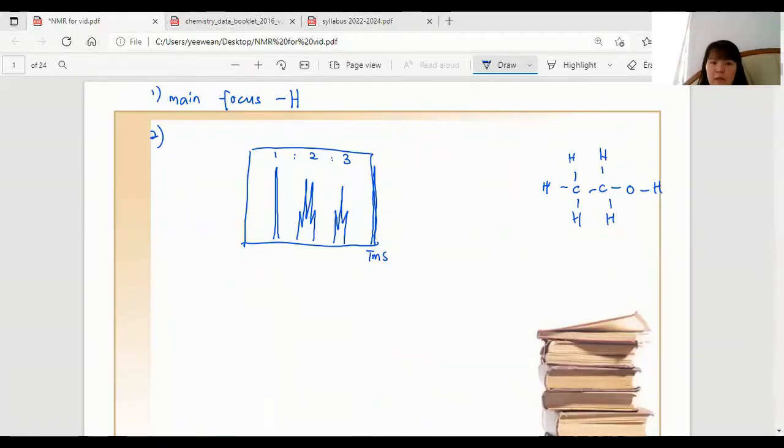This video is about Proton NMR Spectrum. So we're going to read Proton NMR Spectrum. Before this, you should already have some knowledge about organic chemistry. Okay, that said, Proton NMR. Our main focus here is the hydrogens that attach to something, for example, ethanol here. So you do need to have some organic chemistry knowledge to do this part.